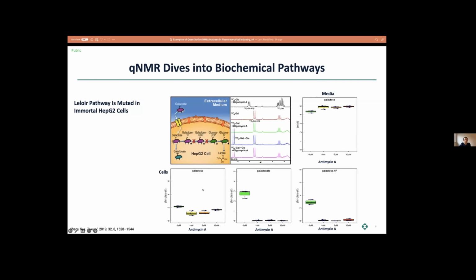We only see the intermediate metabolites from the galactose feeding, for example galactonic acid, which is essentially oxidized into a carboxylic acid. And of course, we also see intermediate metabolites ahead of it, like galactose phosphate, but nothing converted into glucose or lactate. So essentially, this illustrates that in the cancer cells, if you feed galactose, the nutrients cannot be converted into glucose, lactate, or the TCA cycle.